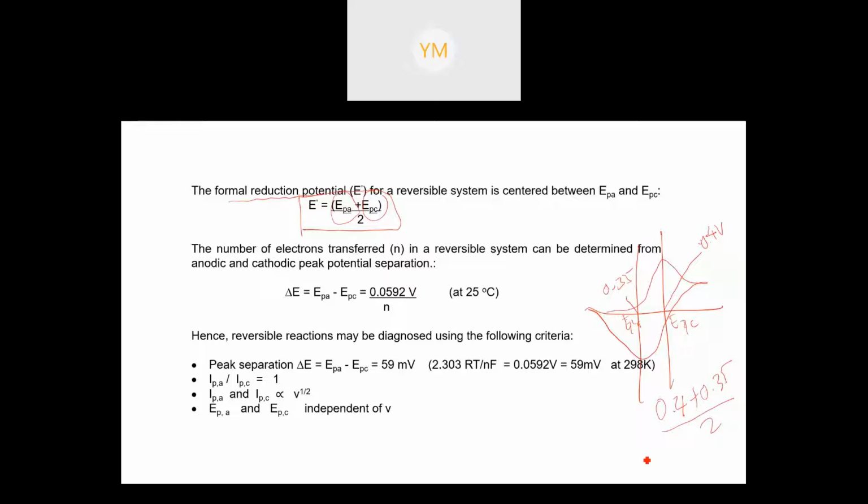You will get 0.375 volt. Okay, so this is the formal potential for that reaction.